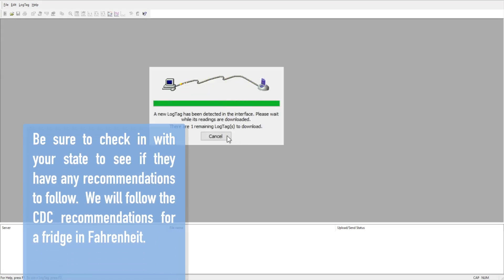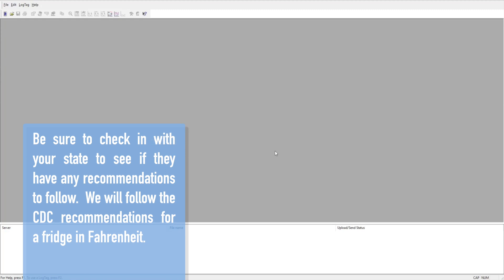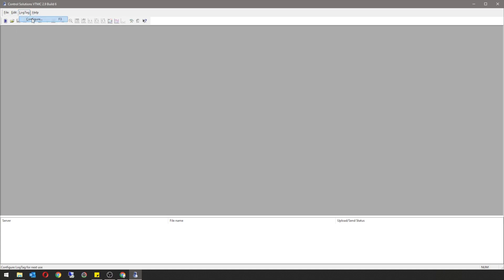Before you configure your data logger, be sure to check in with your state and see if they have any settings that they are recommending you to follow. For this example, we will follow CDC recommendations for a fridge in Fahrenheit. Go to Log Tag, then Configure.